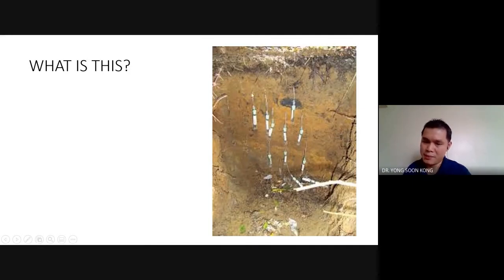So the tip, you cannot see it because it's inside the soil. It's a white color, semi-permeable membrane. That is why it is so expensive. The moment this membrane breaks, there goes your 100 ringgit. Yeah. This is the common way people use to draw moisture. You can actually find it in a YouTube video. Most likely this one is used by agronomists, apart from climatologists also use this.